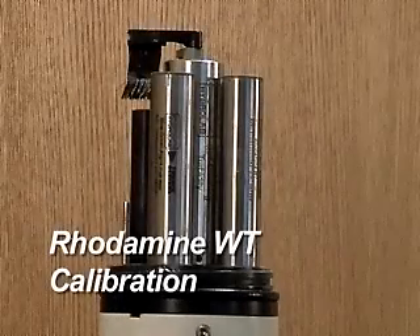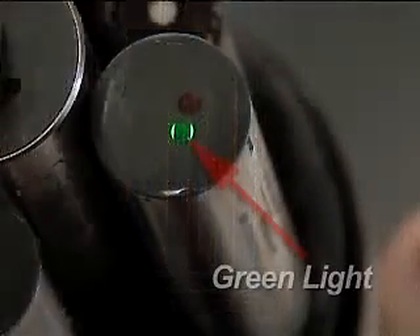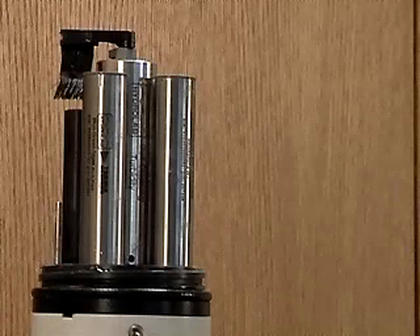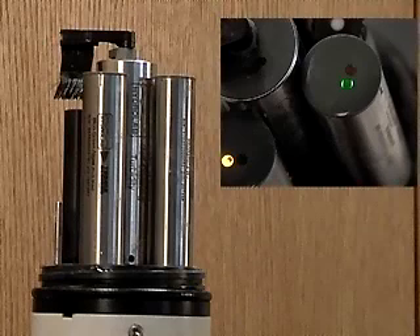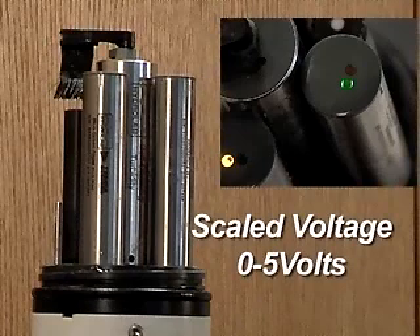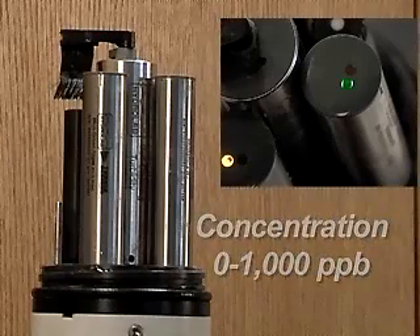Rhodamine WT Calibration — Function. The Rhodamine WT fluorometer emits green light into the water sample, which is absorbed by the rhodamine. The rhodamine fluoresces red light in return, which is detected by the sensor. The amount of red light detected is proportional to the amount of rhodamine in the sample and can be reported as a scaled voltage from 0 to 5 volts, or as a concentration from 0 to 1,000 parts per billion.